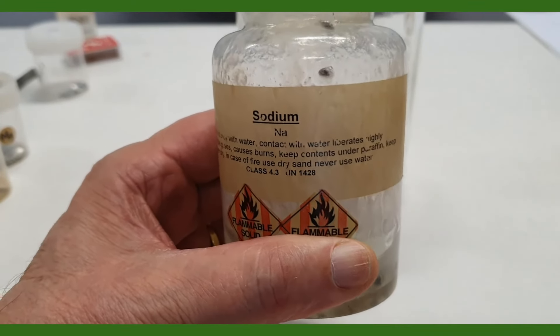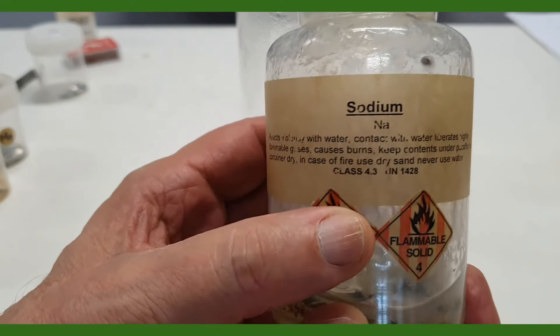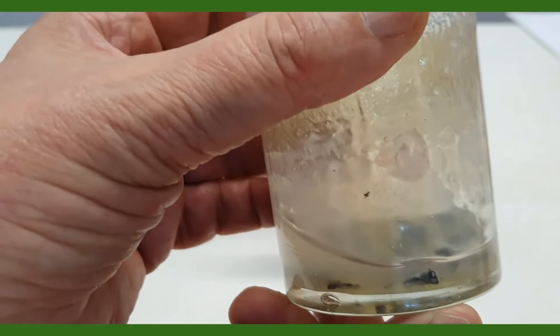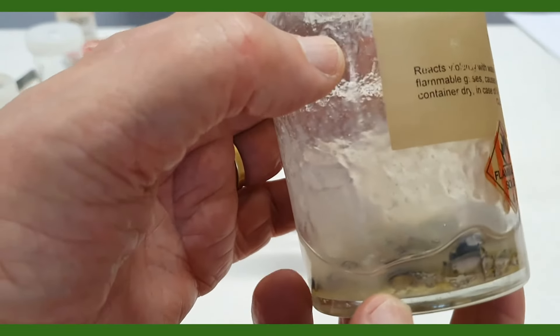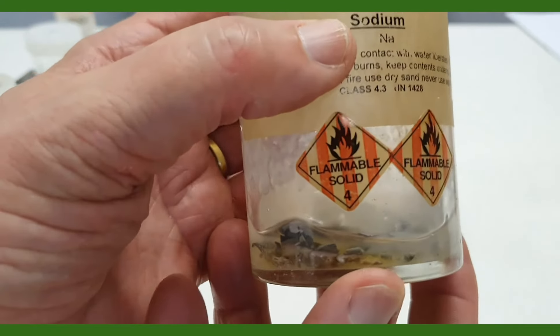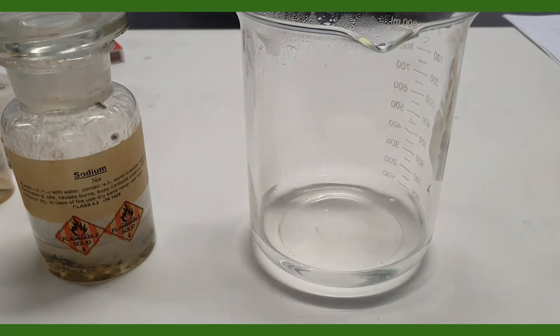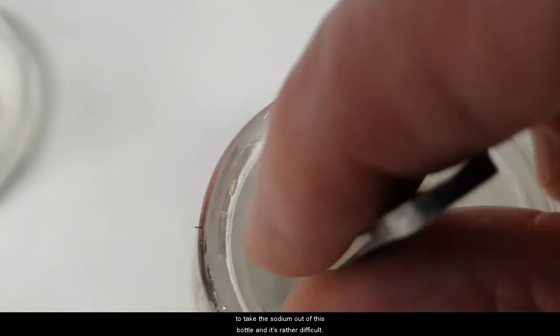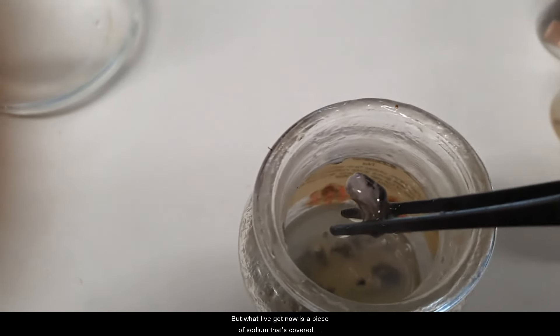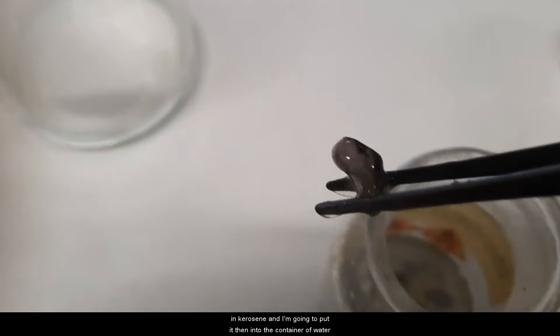Our last test now is with sodium and water. Here you can see the container we've got for sodium. You may be able to read what it says there — it says 'reacts vigorously with water.' At the moment it's in kerosene. What that kerosene does is seal away the oxygen of the air from the metal. You can see there are small pieces of metal in the container. What I'm going to do is take one of those out and put it into cold water.